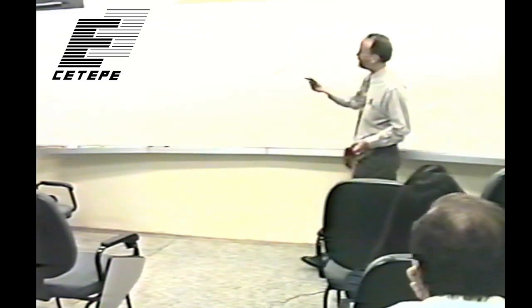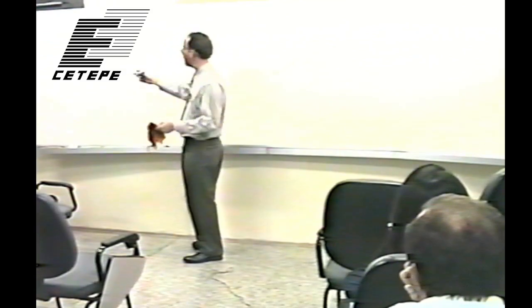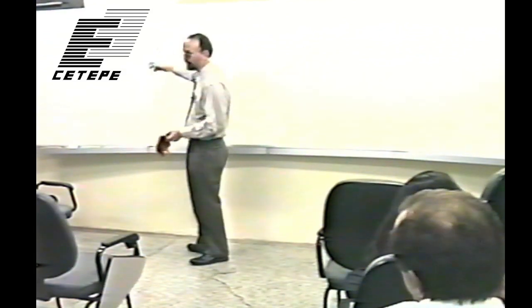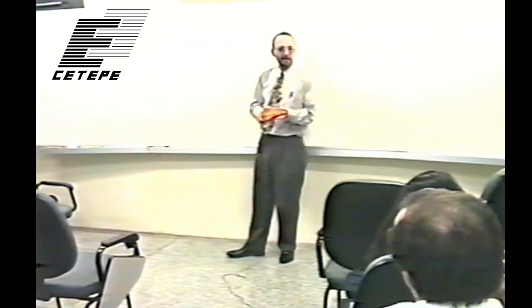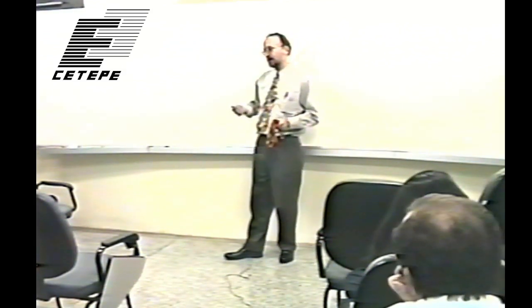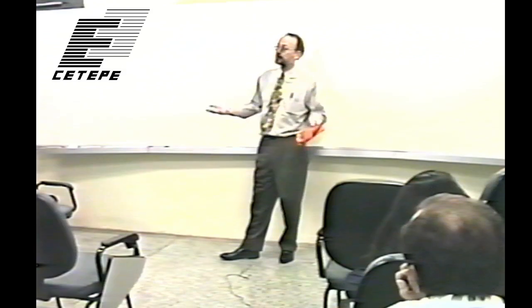So you could try to pick a target for one image that produced X-rays above and below the K-edge of whatever your contrast was. So you might pick copper for one exposure. I don't know if these are the right elements, but if you had a research situation where you could change the anode in your tube, like we can, you might take one exposure with a copper anode, and another exposure with a silver anode.